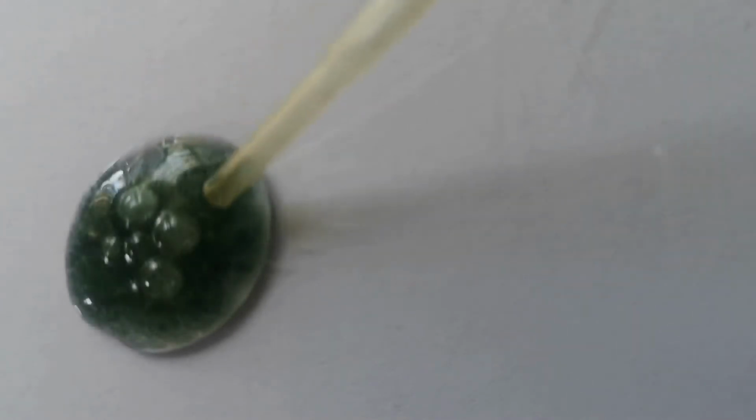Iron has two common oxidation states, iron 2+ and iron 3+. Here you can see that adding dilute sodium hydroxide to a solution of iron 2 sulfate produces a green precipitate of iron 2 hydroxide. Green is the characteristic colour of iron in the 2+ state.